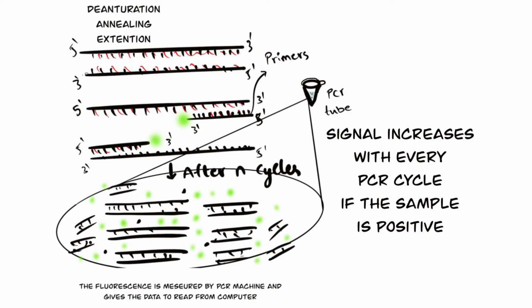First thing that happens is conversion of RNA to DNA, because PCR cannot be performed on an RNA sample and the virus is single-stranded RNA, not DNA. So by using reverse transcriptase polymerase, it is converted to DNA. Then the specific primers, which are complementary to the DNA strand, will bind to the DNA, and the primers elongate from 5' to 3' direction, and after finishing production of every single strand of DNA, the fluorophore is released.